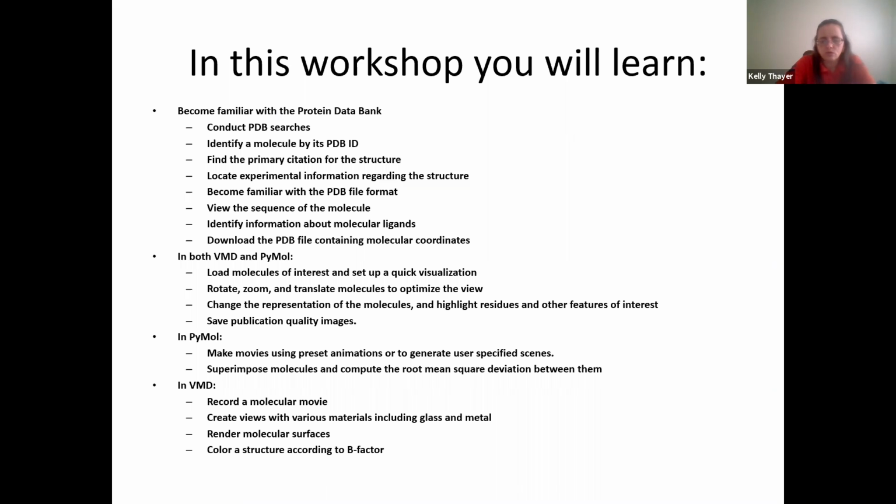What you're going to do in today's tutorial portion of the workshop is the following. Become familiar with the Protein Data Bank, so you've already worked on that. You've already had a look at the PyMOL portion of this in the last section. And then in VMD, what you're going to work on is doing the rendering again, but using this version instead. Record a molecular movie, create views with various materials, including glass and metal. That's really fun because you can make your molecule look really nice. Then you can render the molecular surfaces and color structure according to the B factor, which could be a useful thing to do.